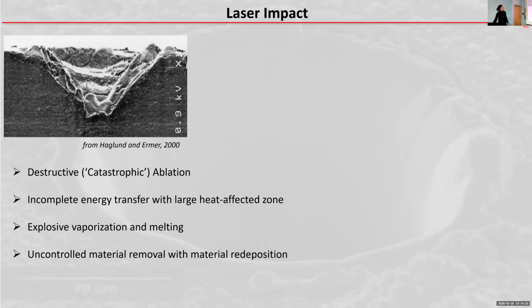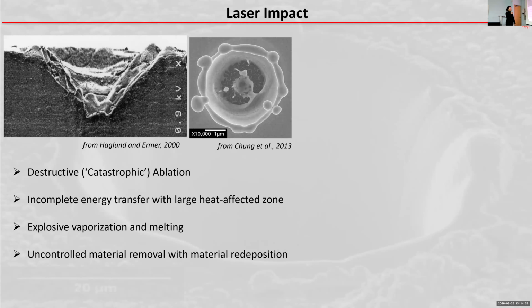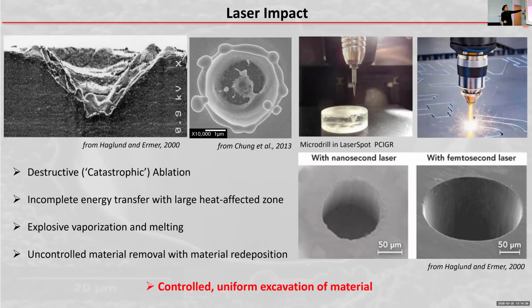You also do not want any melt rims to form or melt droplets to fall back down onto the sample material, because, and you will see in a minute, you want the material to go to the ICP to be analyzed and not to get lost for analysis. What you really want is to use the laser as a little drill. And that's basically what it is. It's a very expensive little drill.